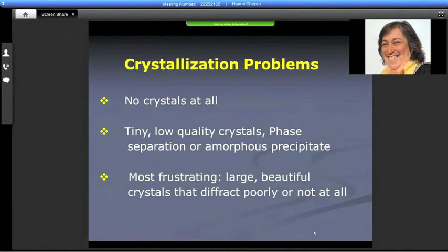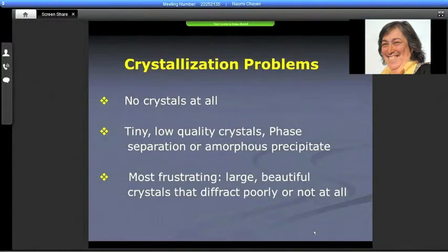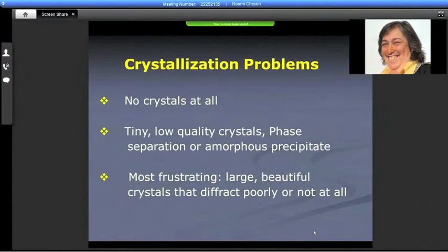Anyone who has ever tried to crystallize any protein or other biological molecules has encountered at least one, if not all, of these problems: getting no crystals at all, getting tiny low-quality crystals or precipitation, and of course getting beautiful crystals that either diffract poorly or don't diffract a single spot.